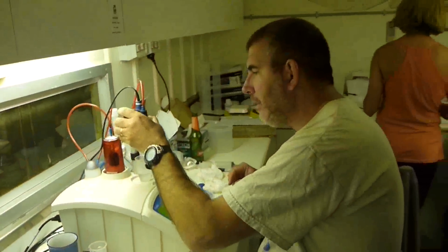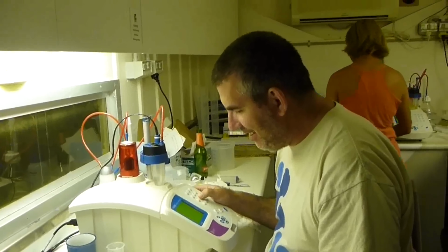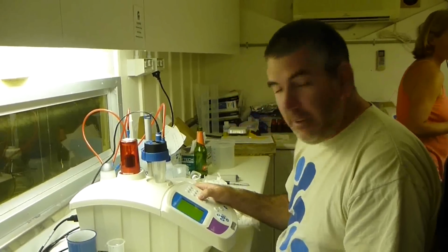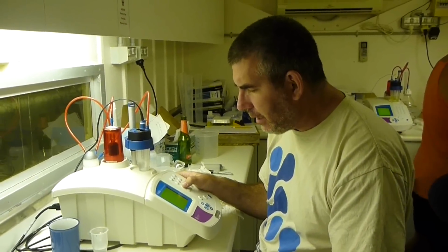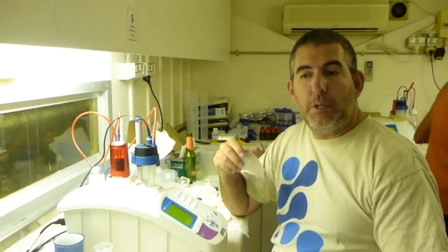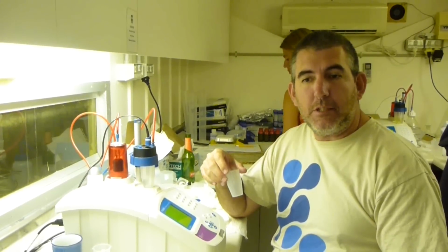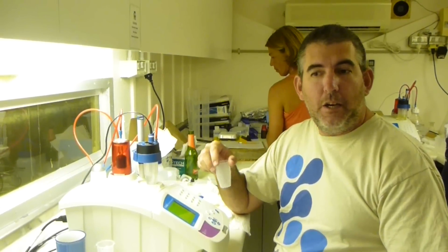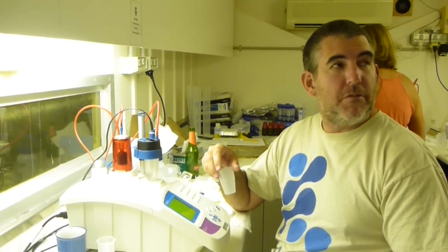So Jack, what do you think of this machine? Well, it's not a very easy machine. It's not a machine that can be operated by a beginning user. It needs to be programmed by someone who has a lot of experience doing alkalinity titrations, optimizing the process. It took us quite a while to do that here. Initially, it would take us around 8 minutes to finish titrating a sample, and now it takes us about 3 minutes.